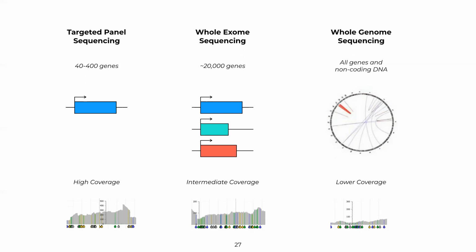Then these can be pulled down and washed to clear the excess material. So this is what's happening in a beaker. The beads are then removed, and the genomic fragments can be sequenced for selective DNA sequencing of the genomic region of interest.